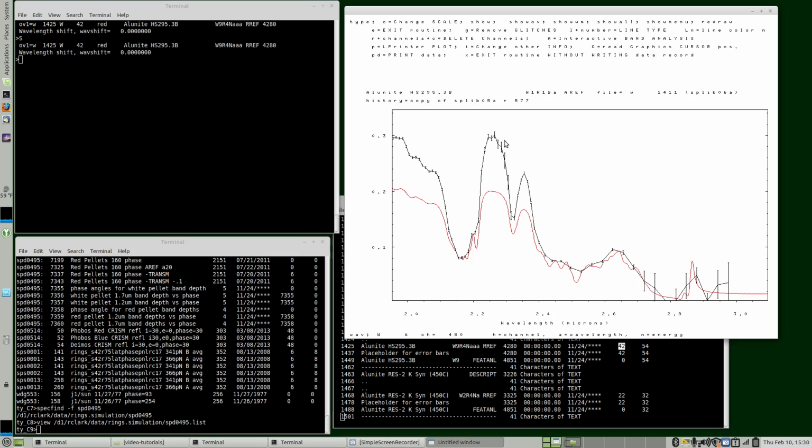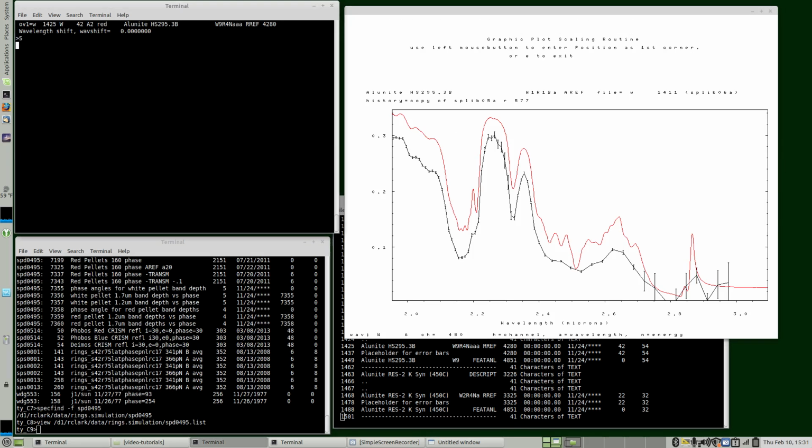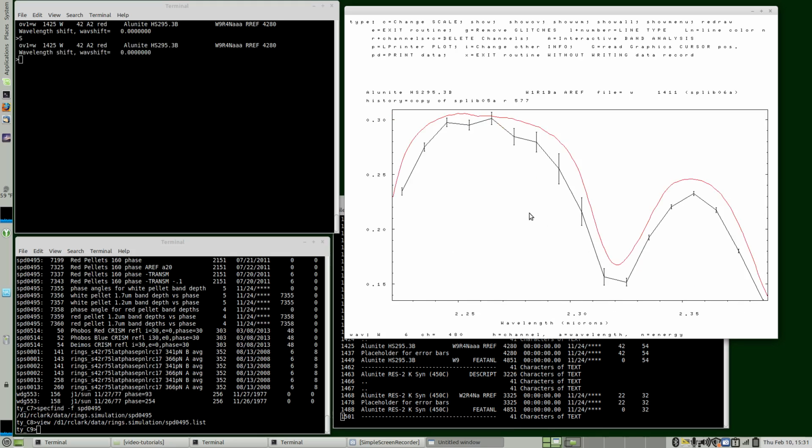If you wanted to compare these two bands, a better way to do that would be to autoscale. And you can autoscale or autoscale with a 2% buffer on the top and bottom. So if we do that, now they're autoscaled. So if we now zoom in, just from here to here, the auto scaling is controlled by different values here and here.